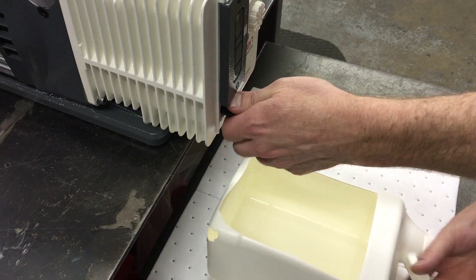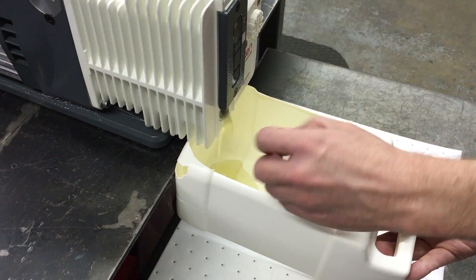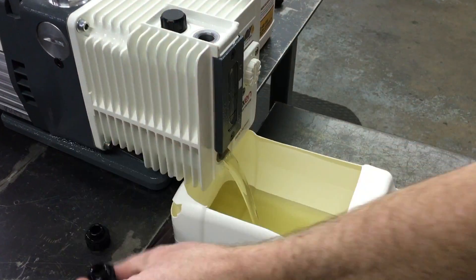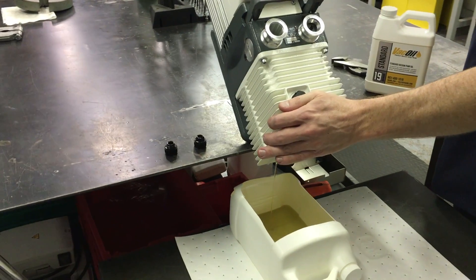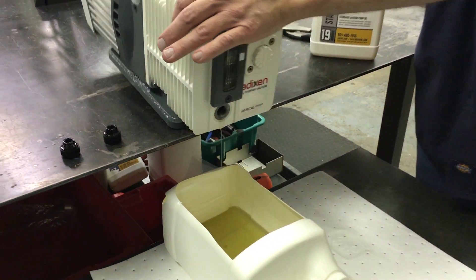To drain the oil, use the channel lock wrench to loosen and remove the drain plug. After the drain plug is removed, unscrew the oil fill plug for faster draining. Remember to tip the pump to remove as much oil as possible.